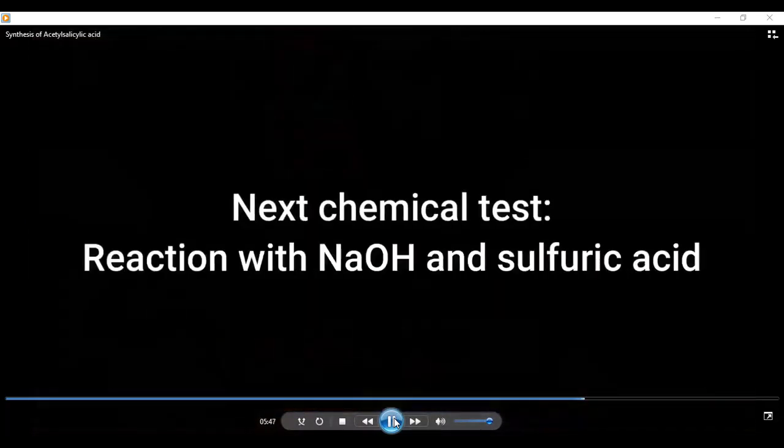So we'll proceed to the next chemical test. Chemical test number 2 is the reaction with sodium hydroxide and sulfuric acid.